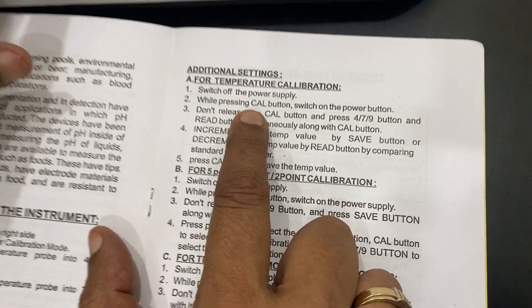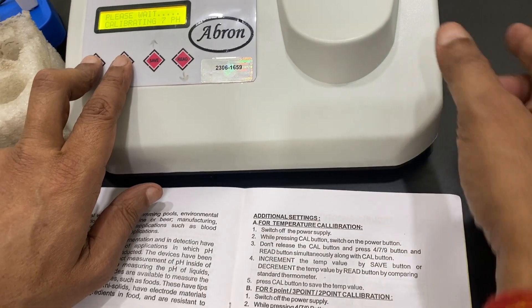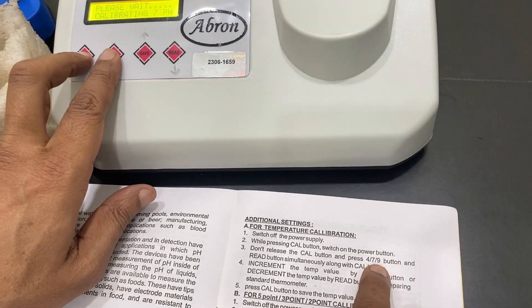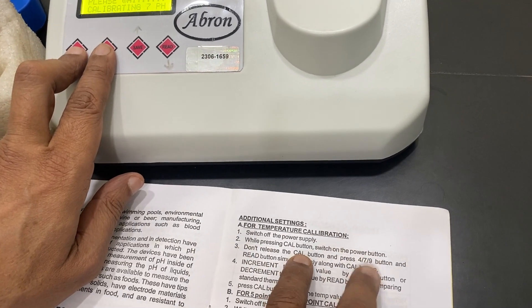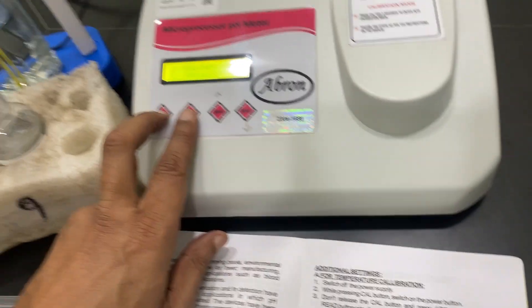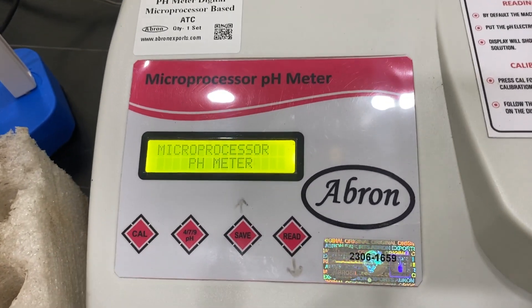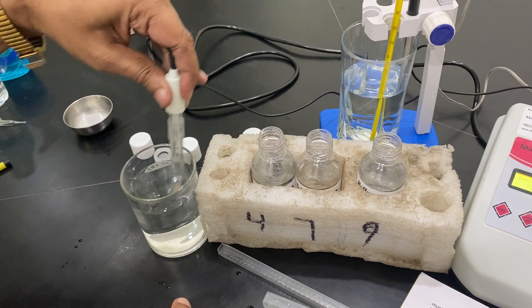For temperature calibration: switch off the power supply while pressing the cal button, then press cal together with the 4/7/9 buttons simultaneously. Press it — now it shows successful. Microprocessor shows successful.